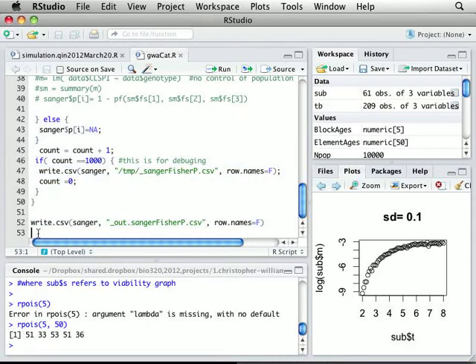But if everything runs fine, I also write everything to a final file. So if everything runs smoothly, there's also a final file output.